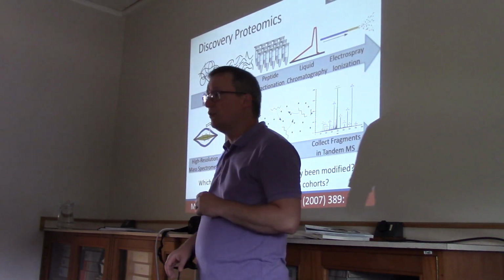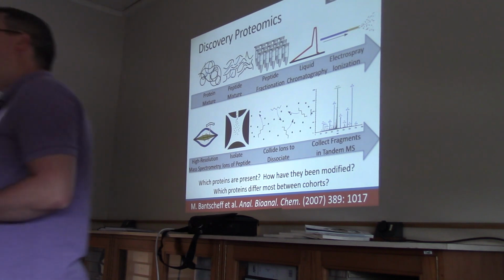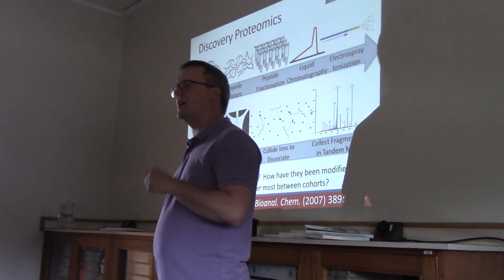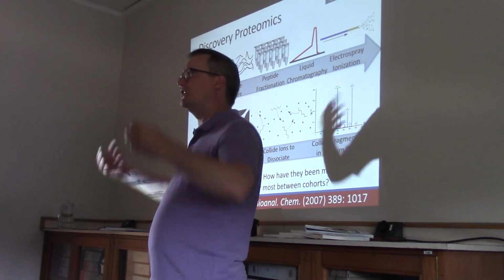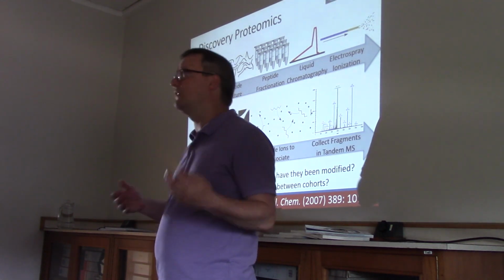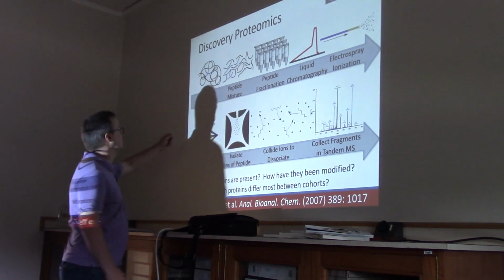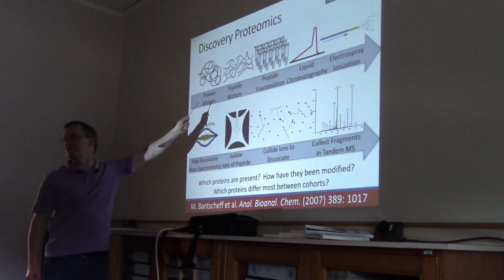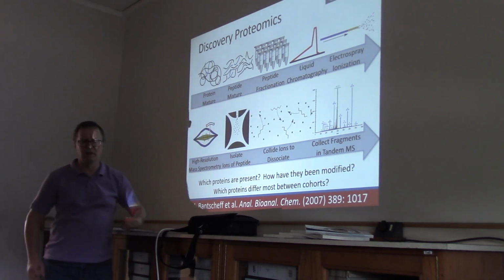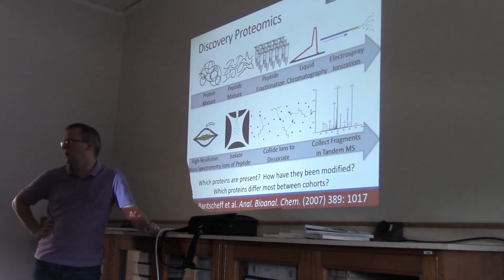Generally speaking, we're going to start our experiments with a protein mixture. Because after all, most biologists care an awful lot more about proteins and what they're doing in cells than individual peptides, because in vivo, they function as proteins typically. So we start with a protein mixture, and one of the very first things we do on the bench is make that mixture much, much more complex. How many different proteins do we have in a given cell line?